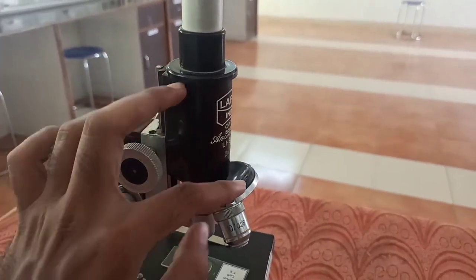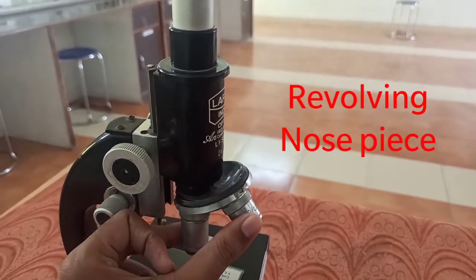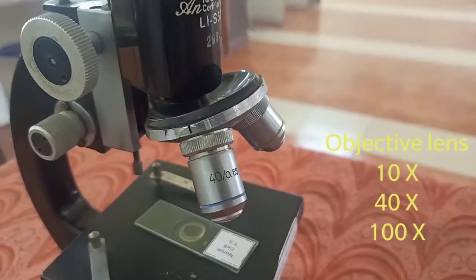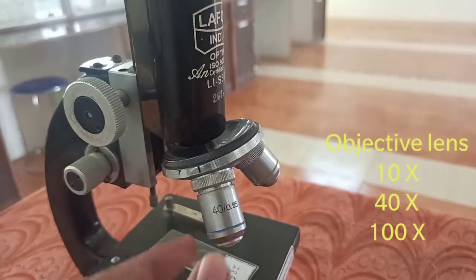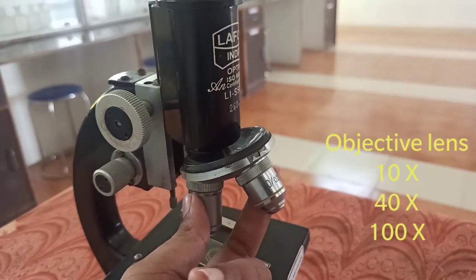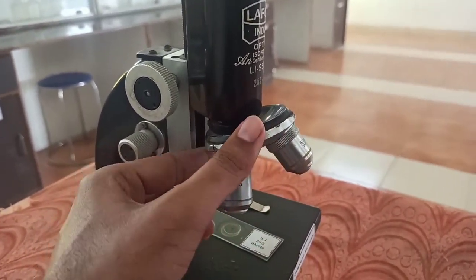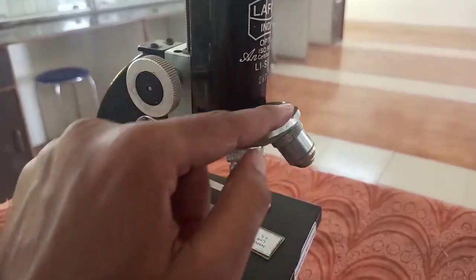The body tube at the base has a revolving nosepiece. It means it can revolve — I am revolving it here. It contains three types of objective lenses. As you can see, there are three objective lenses: this is the 40x objective lens, then there is a 10x — you can see the 10x here — and there is a place for the 100x as well. The image formation depends on the objective lens, and the objective lenses are fixed in the revolving nosepiece.